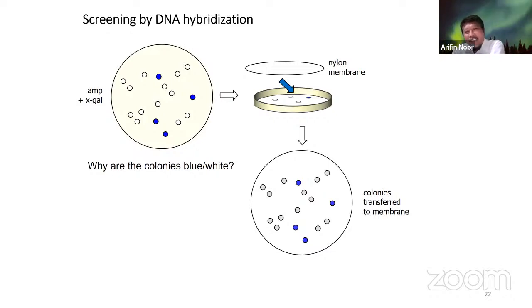I use the chemiluminescence one. Of course, I didn't use the radioactive ones. So it is easy, and you do not need the radioactive installations. Absolutely. That's another type of probe that we use.